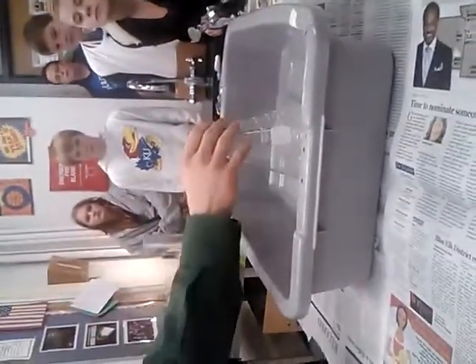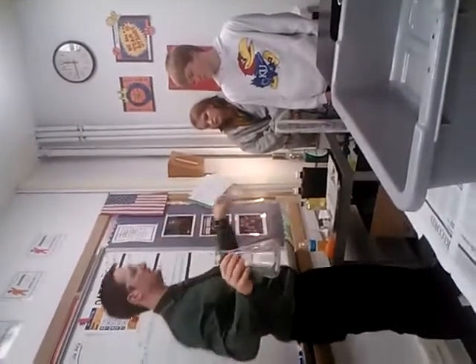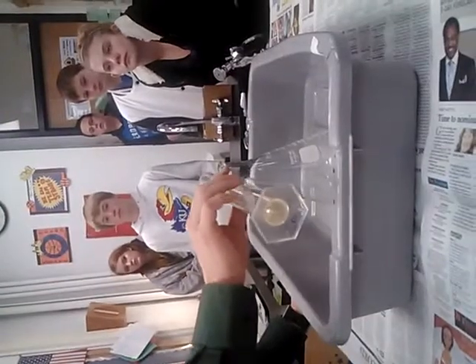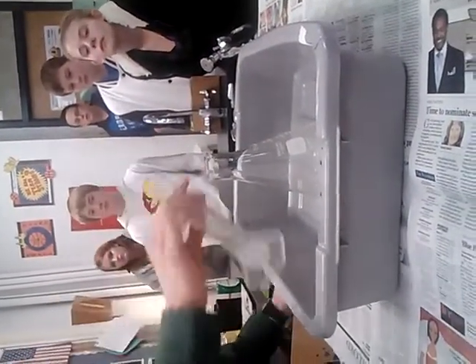We're going to pour that into our, this is called an Erlenmeyer flask. This happens to be a 1,000 milliliter Erlenmeyer flask. For our lab that we're going to start talking about today, we're going to use 125 milliliter Erlenmeyer flasks. But I guess if you create a piece of scientific glassware, you get to name it, and he named it after himself, and his name is Erlenmeyer, so it's pretty interesting. Pour some of that into there.